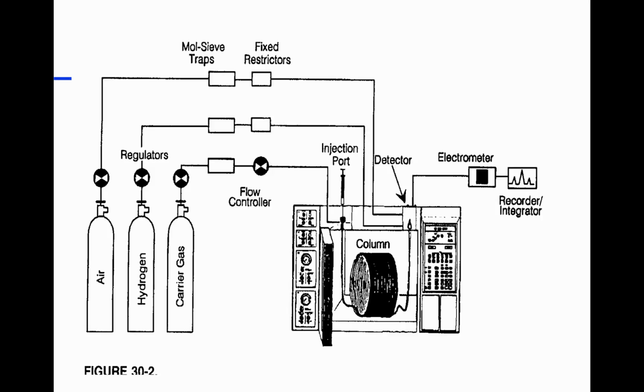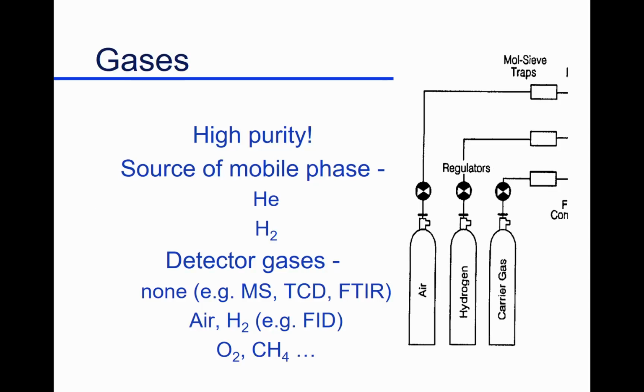Typically, it's done more commonly today with an automated injector. It's a robot that sits over there, grabs your sample, puts it in a tray, cleans out the syringe, draws up a sample, brings it over, injects it into the gas chromatograph, much more accurately than we can. How's that? So that's a little more image to that. We'll go through this system.